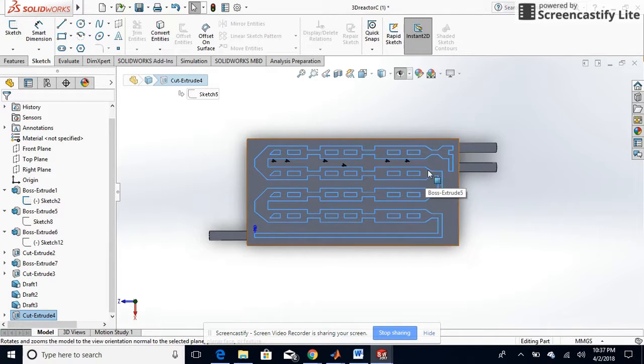So the smallest diameter of the channel is 2 millimeters, seen here and here. That would be 2 millimeters. The baffles here are 2 millimeters and 6 millimeters long for scale. This narrowest channel is 6 millimeters long as well. And this is about 45 millimeters long.